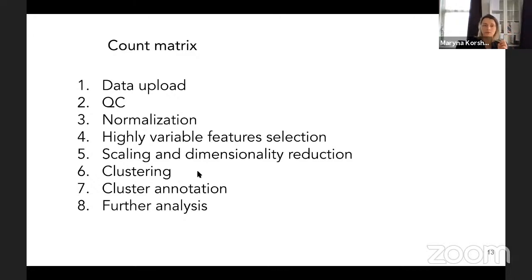The best practice is to check how good the clustering was, using visualization. Usually it's t-SNE and UMAP. It's a very rough approximation to identify whether you have separated cell clusters or not, or if your cell cluster is very close to another cell cluster, and with different clustering parameters, they can be grouped together or split better.